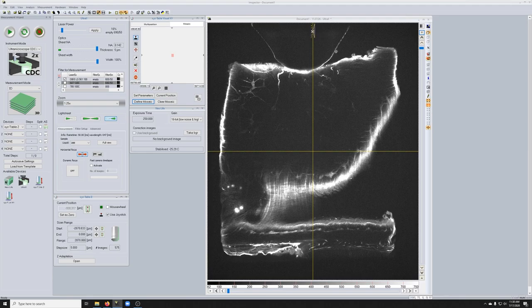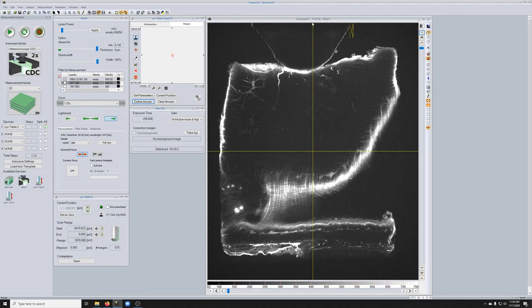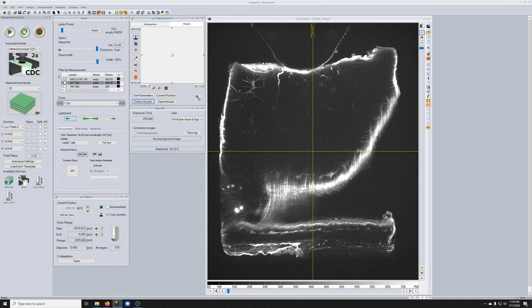Not the quadrant in its entirety, but rather the middle between the actual middle of the imaging and the very edge of the sample, so roughly there, and to do the same or the equivalent thing with the left light sheet.